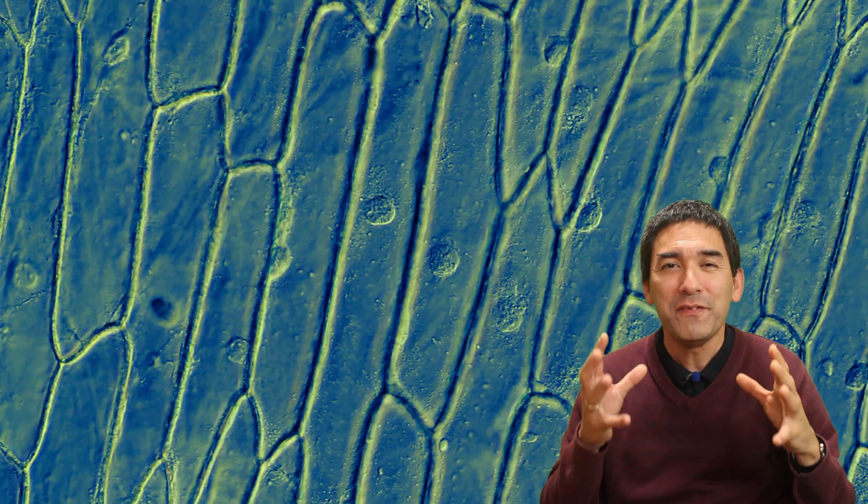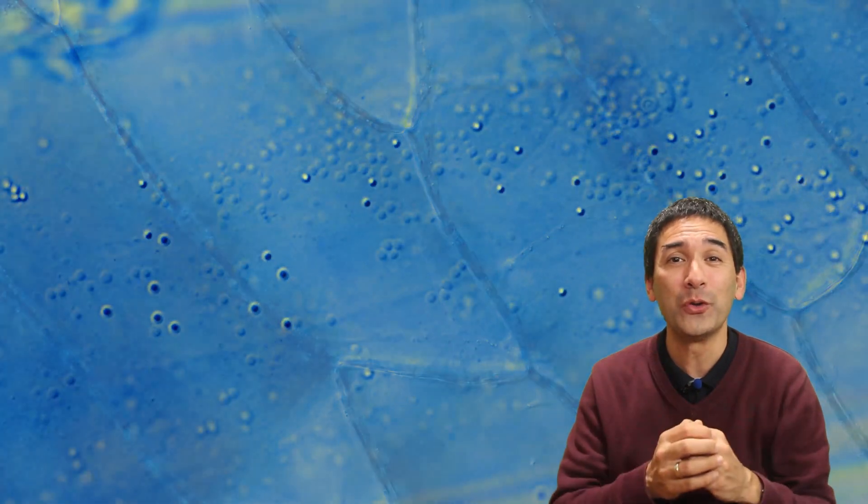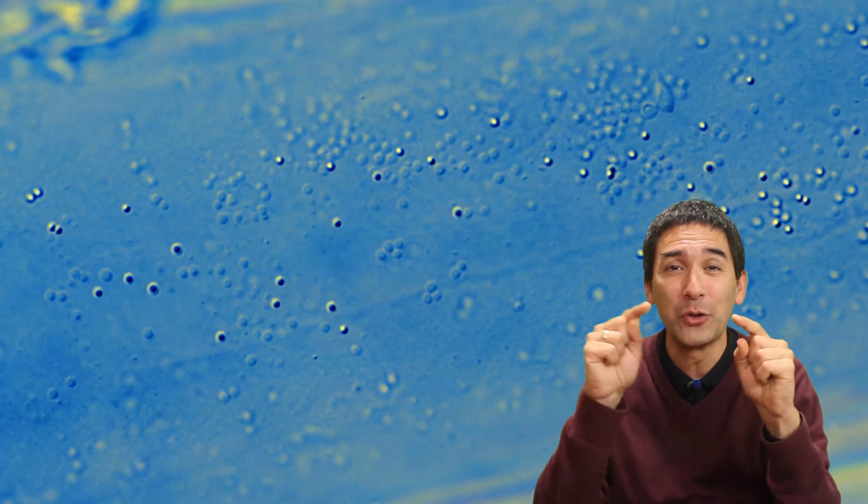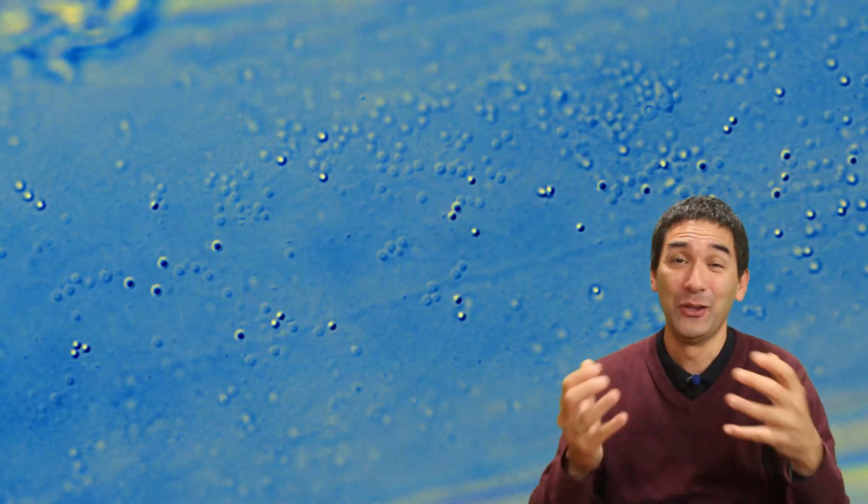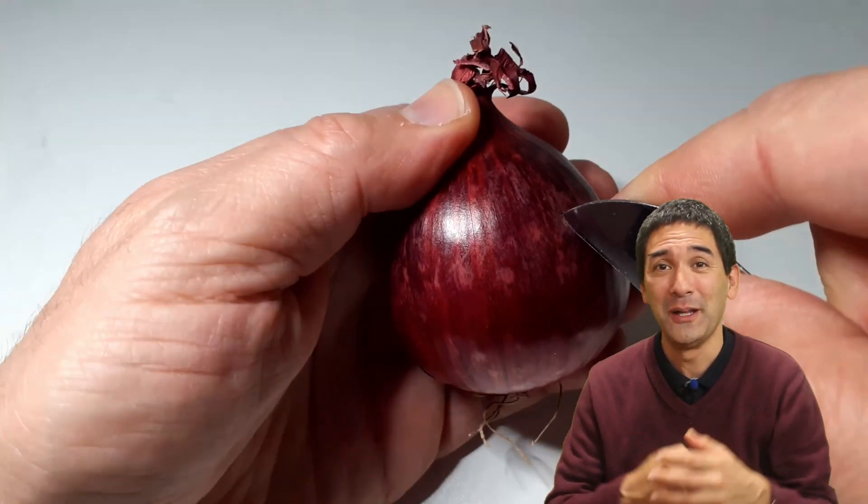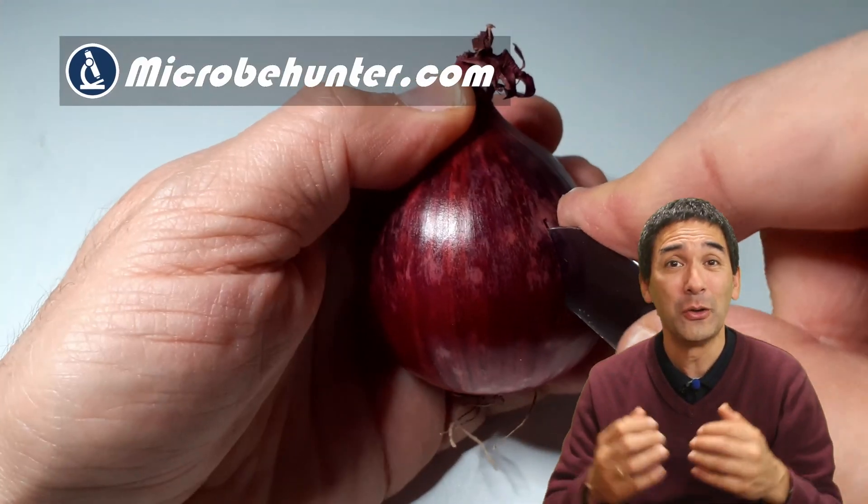So today we're going to have a very deep look into an onion cell, or actually several onion cells, which you can see over here. Specifically, I'd like to show you the movement that's going on inside an onion cell. Those little dots are vesicles. Hello and welcome, Microbe Hunter here. Yes, onions do belong to the beginner specimens.